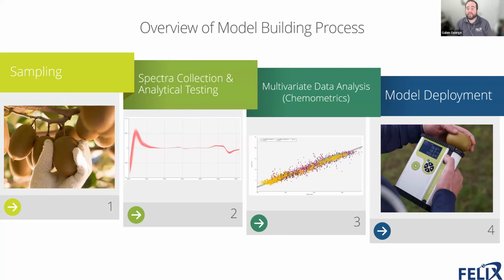And then model deployment is the last stage, where you're actually using it in your real life use case scenario. And the model deployment part is what we're discussing today. We'll be getting into some challenges that you'll face when implementing this kind of technology into your organization, and also talk about what is required to ensure the longevity and robustness of your models.